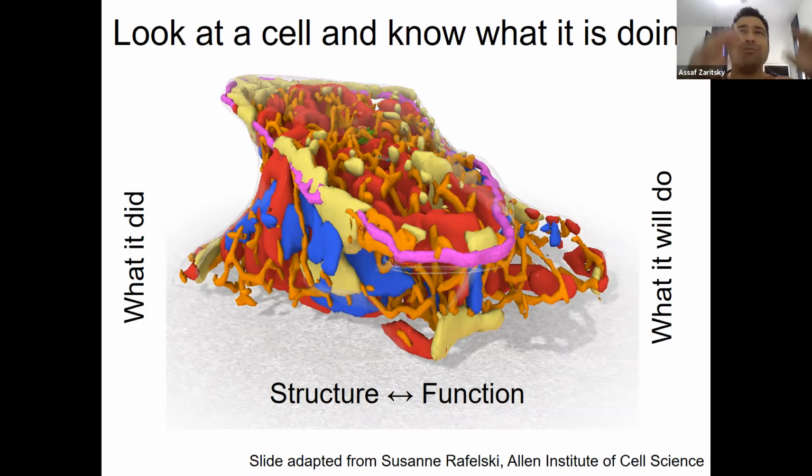So you tag an organelle, you try to understand something about this organelle, and then you move to the next organelle. In the last few years, a whole field has been opening up in cell biology, talking about organelle-organelle communication, or organelle-organelle interaction, right? How these different organelles interact with one another. But again, the technical limitation of imaging multiple organelles at once is the rate limiting step.